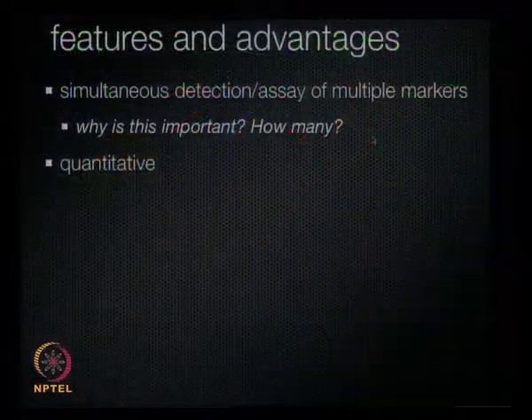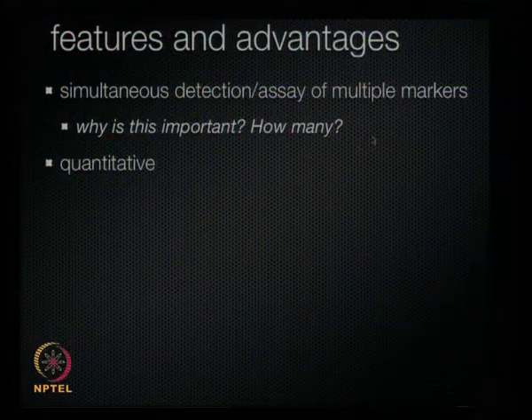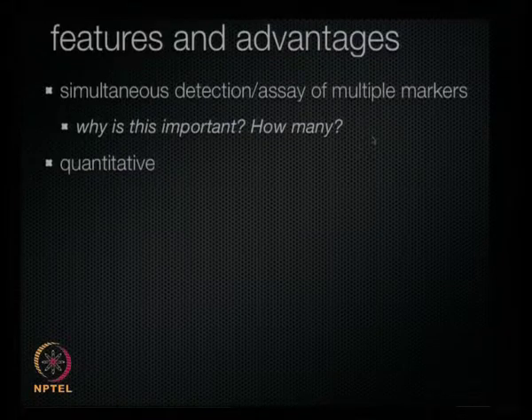Sure. So the approach is also quantitative, because of course the intensity of the signal is proportional to the amount of material that's gone down, and of course you have to run calibration curves to keep the standards going. As we mentioned earlier, there are few false positives, because if things don't fall down on a grating, then it's just not going to be measured.